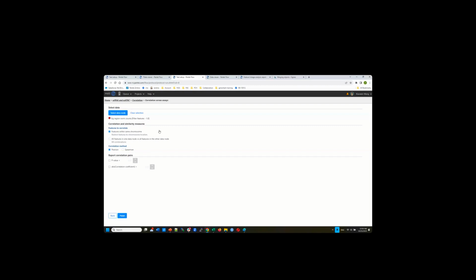You might have a gene on chromosome 1 and a region on chromosome X, and you can perform the correlation. I don't know how you interpret the result. If they have a high correlation, does that mean they are related? So I think most people only need the same chromosome.